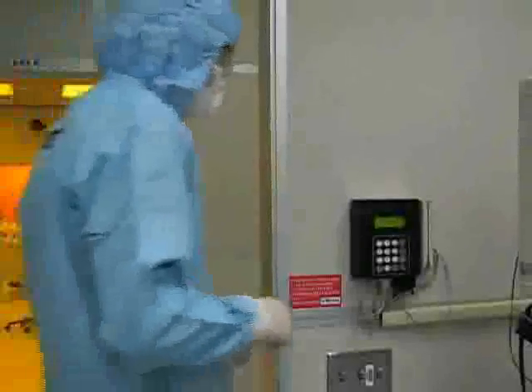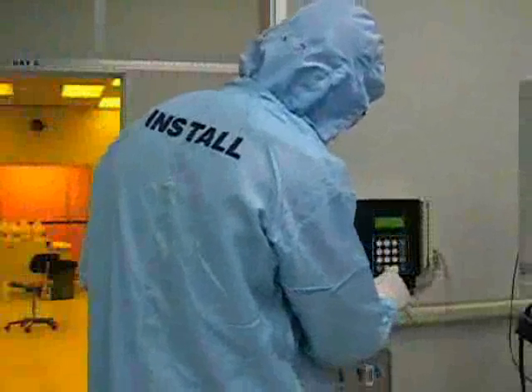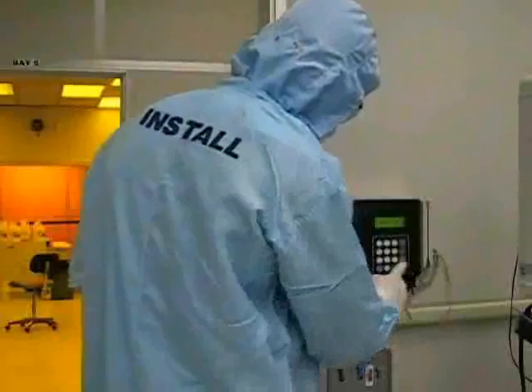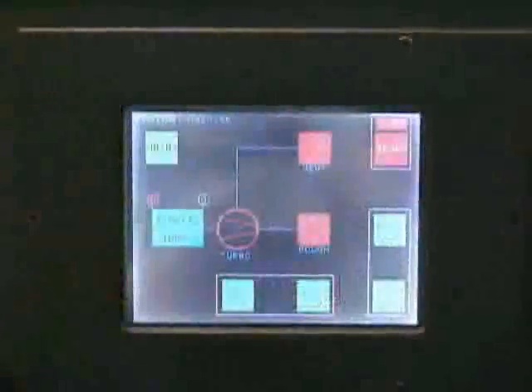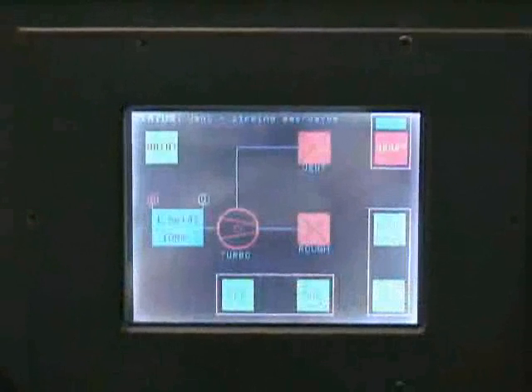Before you are able to use the PVD-75, you must first log into the system at the access controller. Once you are logged in, you should begin preparing your sample for processing. While you are preparing your sample, you should begin venting the system. Press the vent button on the front panel touch screen. This will initiate the chamber vent sequence.